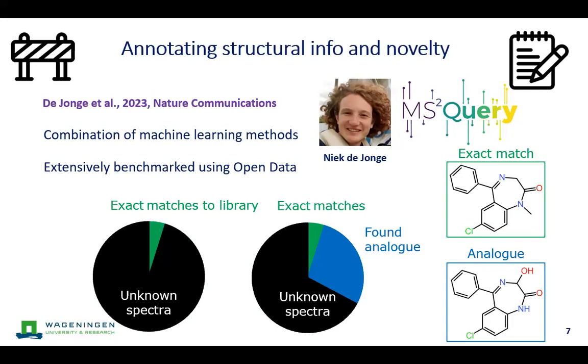We have also seen that the cosine score used in molecular networking in GNPS is the modified cosine score. That means that if there's only one modification, it can typically still find a good score. But as soon as you get two or more modifications, this modified cosine score also gets into trouble. And that's why these alternative methods can become complementary and find more or alternative analogs.